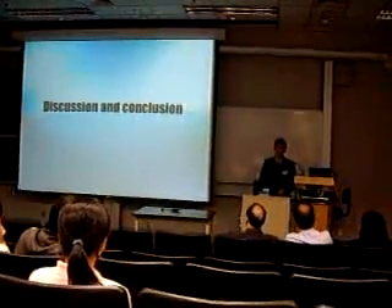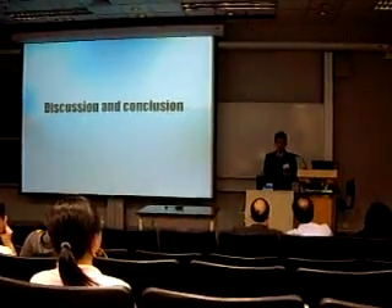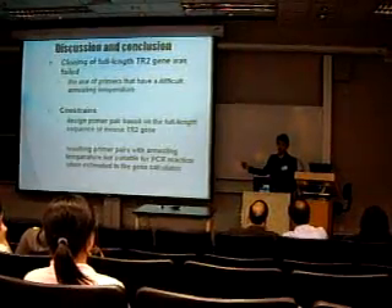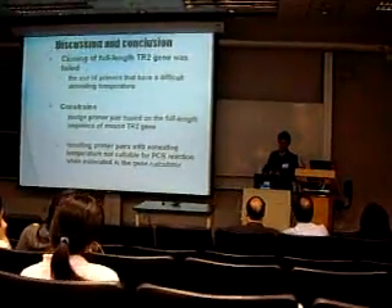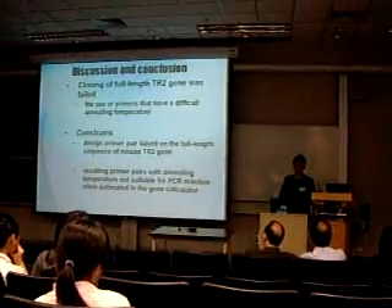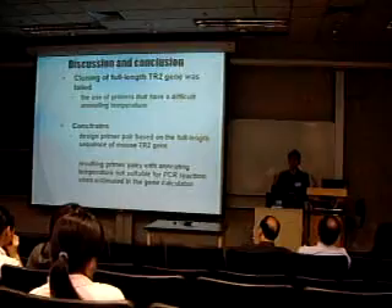In the discussion and conclusion, DNA sequencing should be performed to ensure the PCR product is the target gene we need. However, due to lack of time, sequencing was not done. The weak band seen in the gel result is because it is really difficult to design the primers, as we have to design them based on the full-length sequence of the mouse TR2 gene. The resulting primer pair annealing temperature was not suitable for PCR reaction when estimated in the gene calculator, and there are more factors to consider in designing the primers.